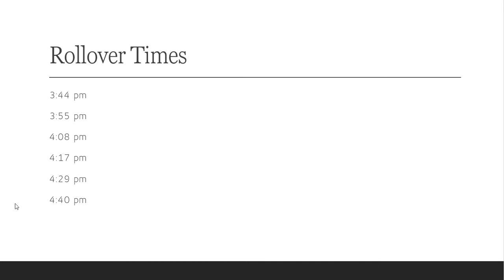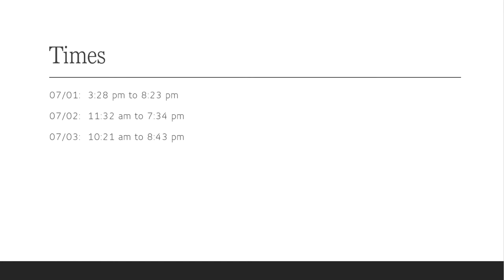Okay, so now that you have those rollover times in your notebook, more times for you to write down as well. So on July the 1st, I ran the peanuts from 3:28 p.m. to 8:23 at night. Yes, folks, I went back out there and I turned off that Soxhlet at 8:23 just to promote your academic success. I did it for you.